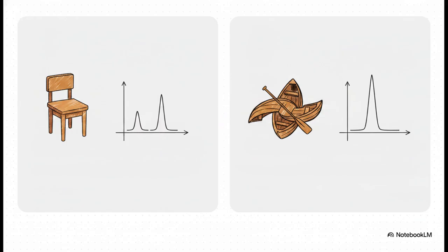If your original diol had its OH groups on the same side, a syn diol, the ring forms a stable chair conformation. That gives us 2 distinct carbon peaks right at 19 and 30 parts per million. But if they were anti, pointing in opposite directions, forming a chair would cause a massive unstable steric clash, so the molecule twists itself into a twist boat conformation to survive. That leaves both methyl groups in identical magnetic environments, and they pop up symmetrically, exactly at 25 ppm.